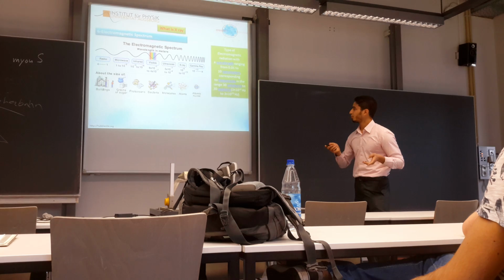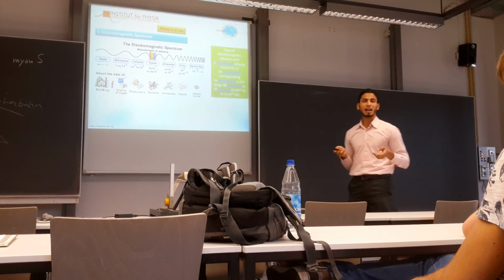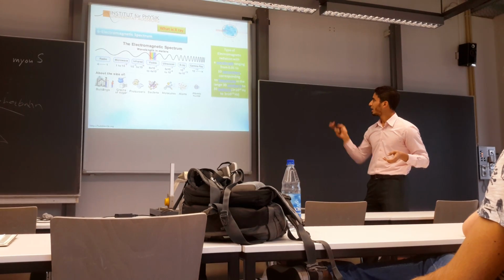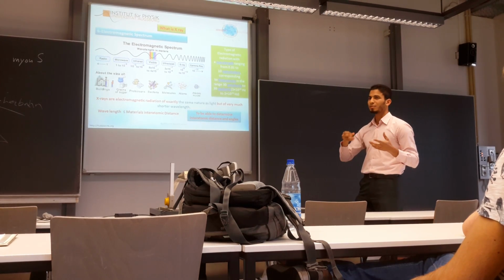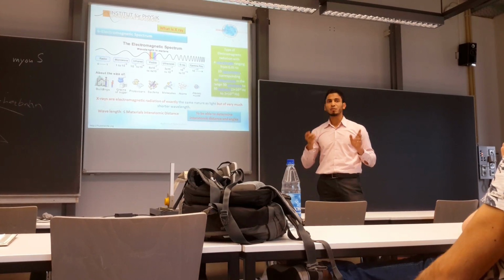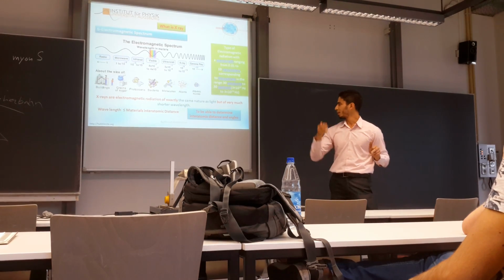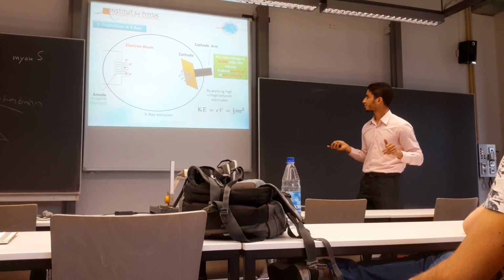X-ray is a type of electromagnetic radiation with wavelengths in the range of 0.01 nanometer to 10 nanometers and frequency in the range of 30 petahertz to 30 exahertz. It's located between ultraviolet and gamma ray, with a nature similar to ultraviolet but with shorter wavelengths. The wavelength of X-ray should be equal to or lower than the interatomic distance of the material in order to be able to determine the interatomic distance and angles.